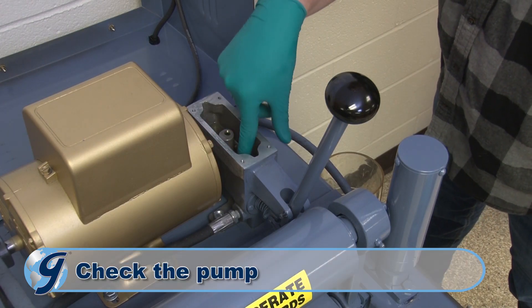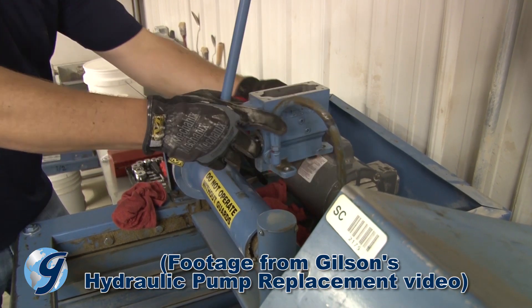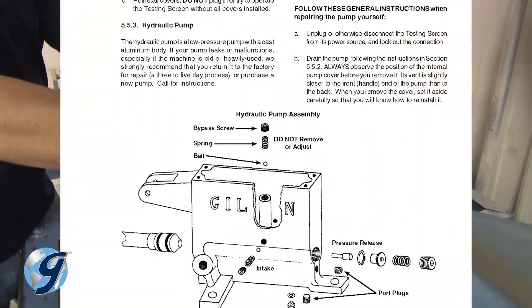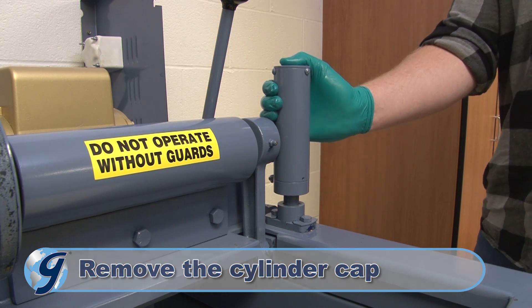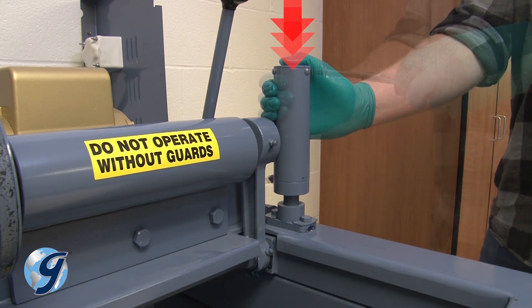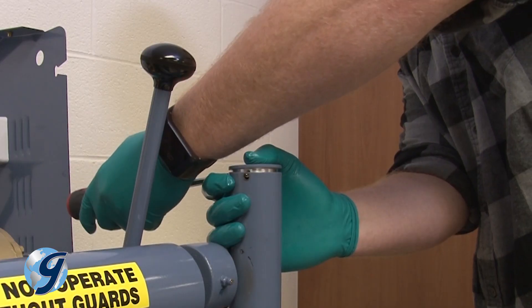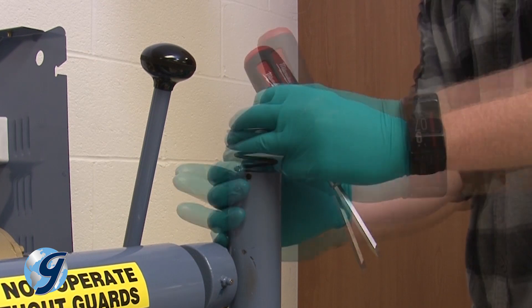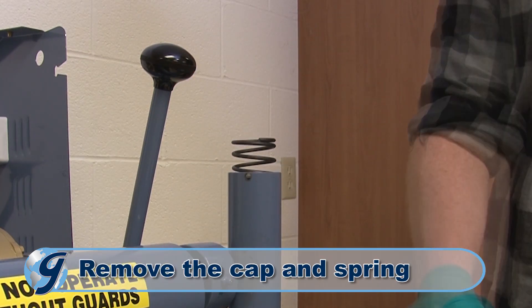If there is sludge in the bottom of the pump reservoir, remove the pump from the machine and clean it out with solvent as described in your operating manual's hydraulic pump section. Next, we're going to remove the cylinder cap. Keep pressure on the cap with your hand as you remove the three screws. Then release the pressure of your hand slowly so the compressed spring does not suddenly pop out. Remove the cap and spring and set it aside.